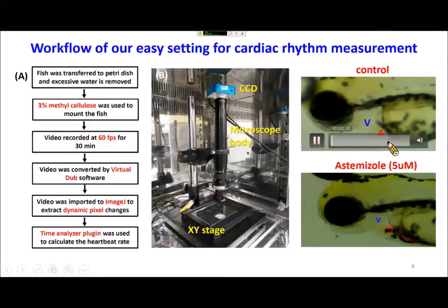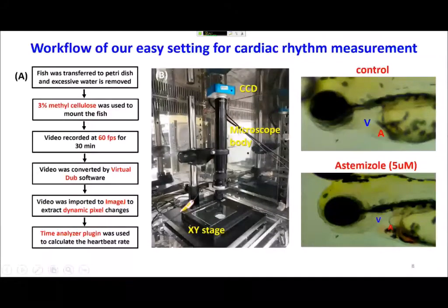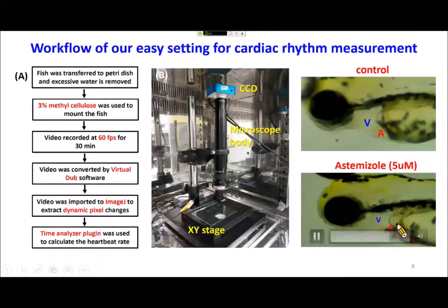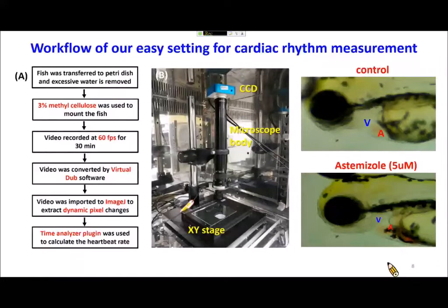This video shows the normal heartbeat pattern of control fish — atrium to ventricle is one-to-one. But after chemical treatment with MS222, you can see the fish already has arrhythmia, showing irregularity of the atrium and ventricle beating. Based on this video, we can extract information from the dynamic pixel changes.